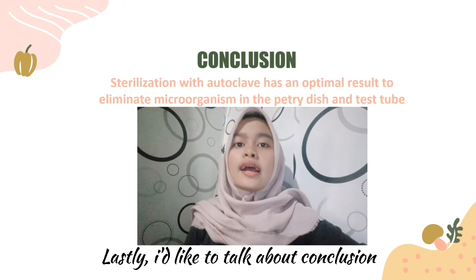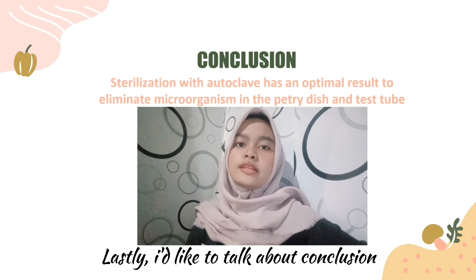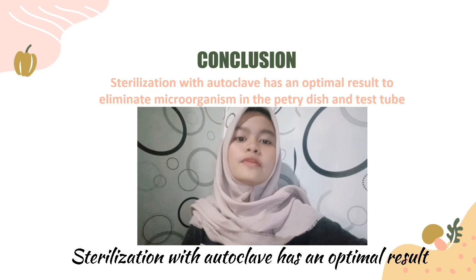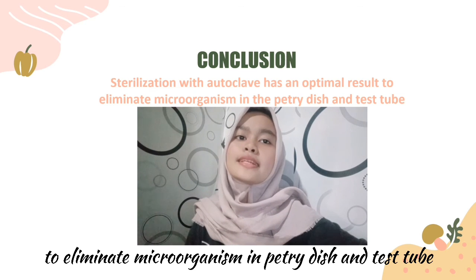Lastly, I'd like to talk about the conclusion. Based on this research, sterilization with autoclave has an optimal result to eliminate microorganisms in petri dish and test tube.